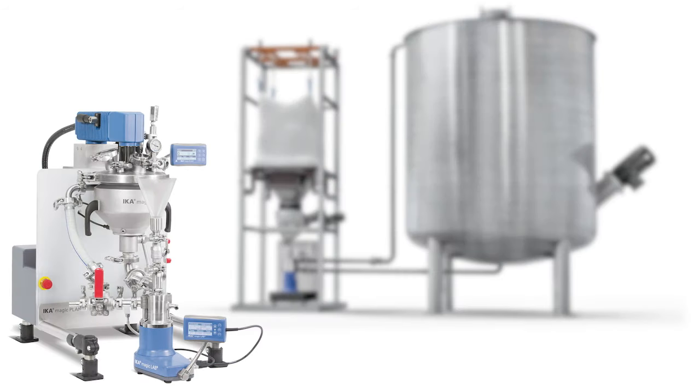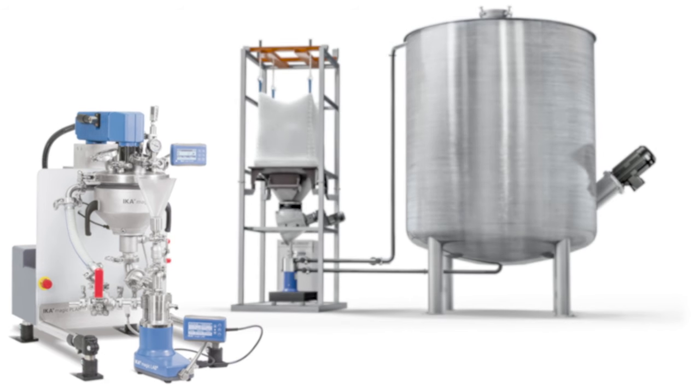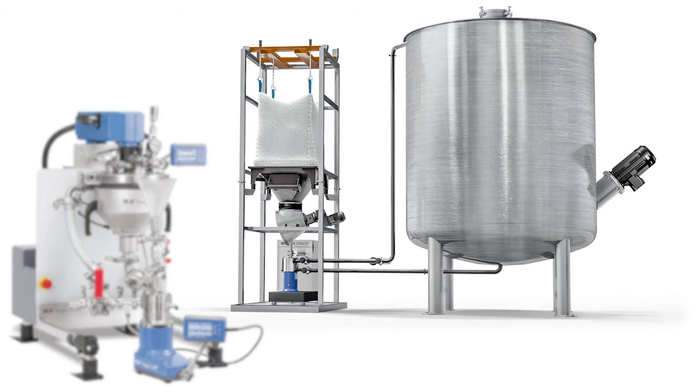The CMX is available in seven sizes, for batches ranging from 1 litre to 40,000 litres. This makes it suitable for applications in laboratories, as well as for applications on a production scale.